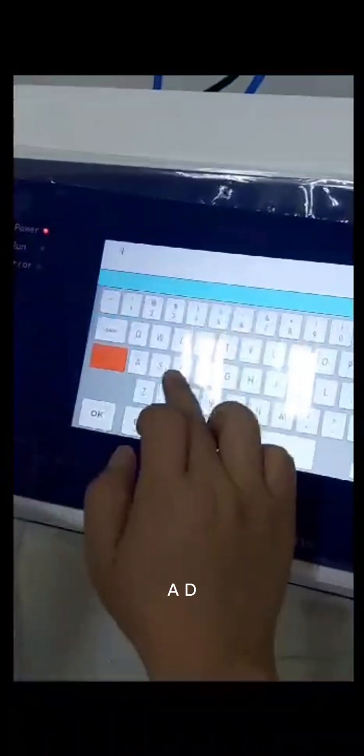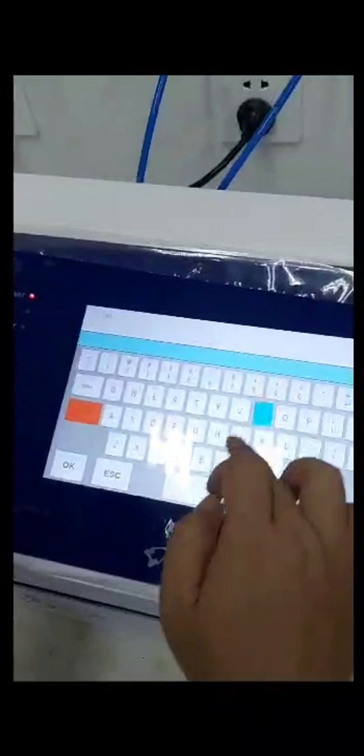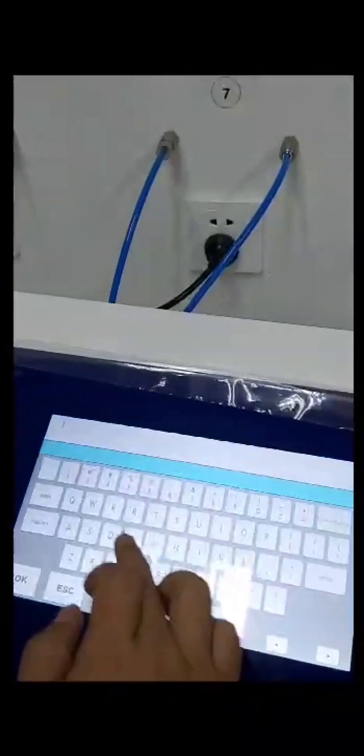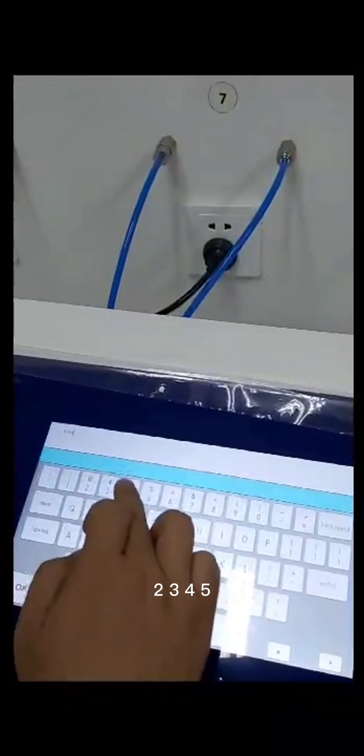Username A-D-M-I-N. One, two, three, four, five, six.